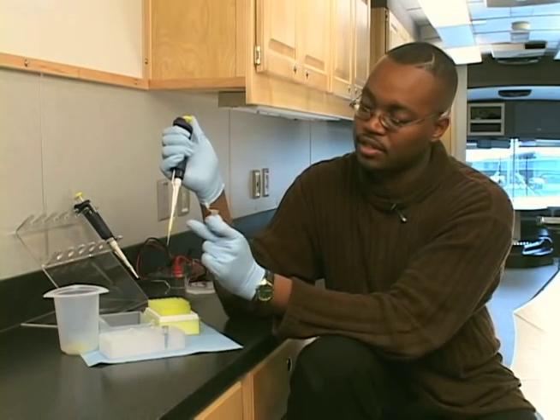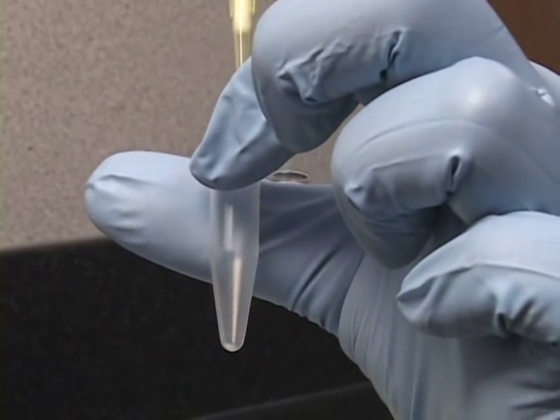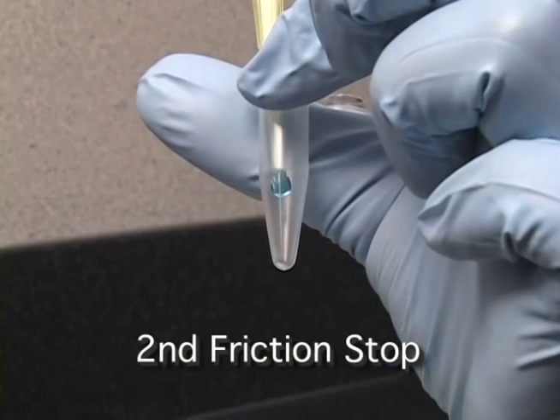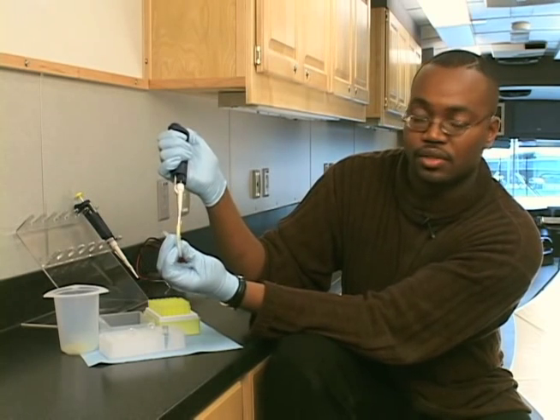By doing that, that's going to force the liquid out of the pipette tip. So you put your pipette tip against the walls of the micro tube, and by pushing all the way down to the second friction stop, I am releasing all that liquid into this tube.